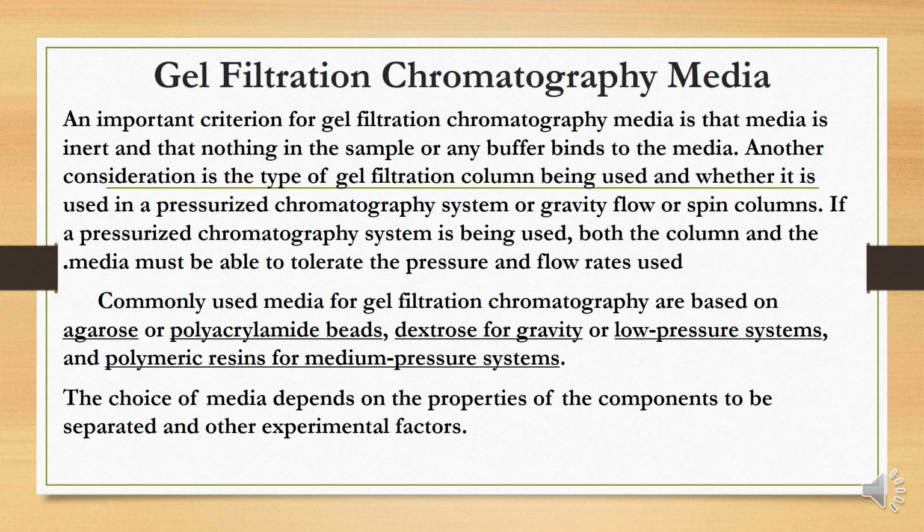Another consideration is the type of gel filtration column being used and whether it is used for a pressure chromatography system, gravity flow, or spin column.